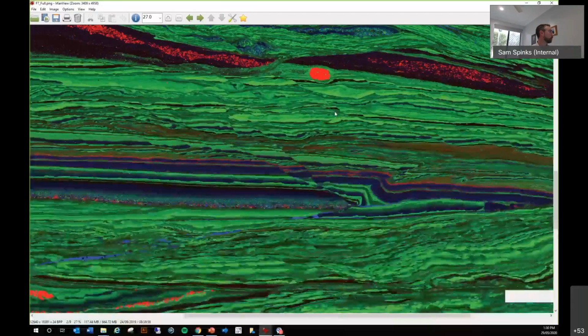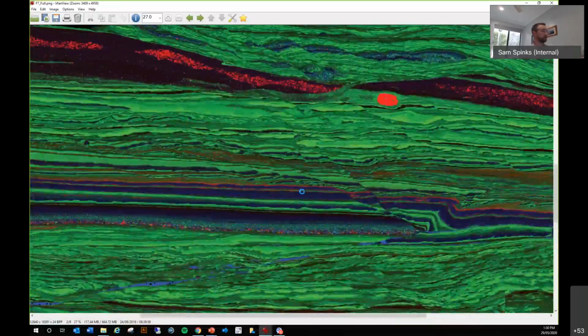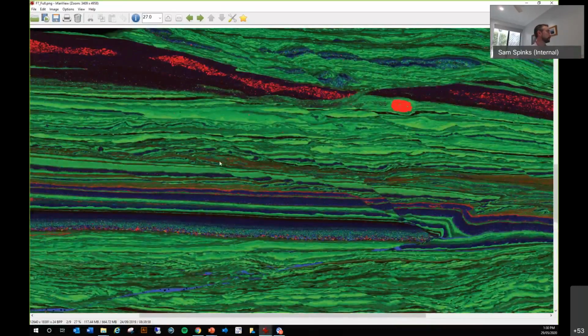This is a really, really pretty rock, but it's so high grade it doesn't have much to tell us, because any carbonate that was there, if our model of carbonate replacement is correct, is completely gone and replaced by sphalerite. But the textures of the original carbonate are preserved.